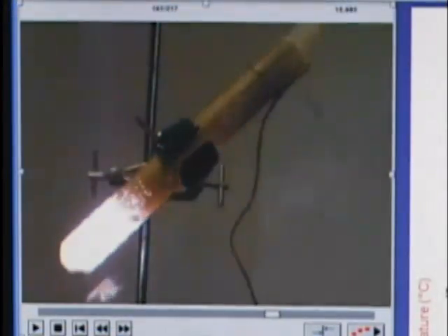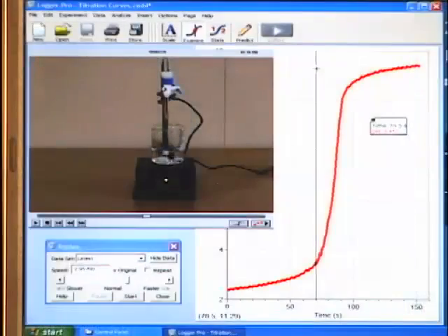For example, one might ask what the color of a solution was when the pH crossed through 7. A synced video can answer that question.